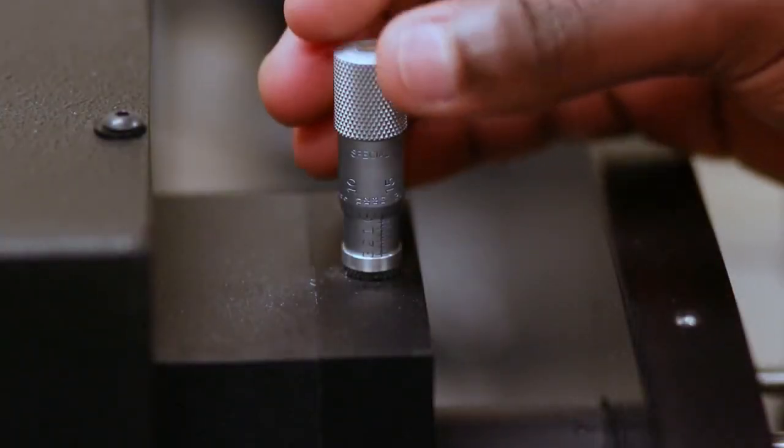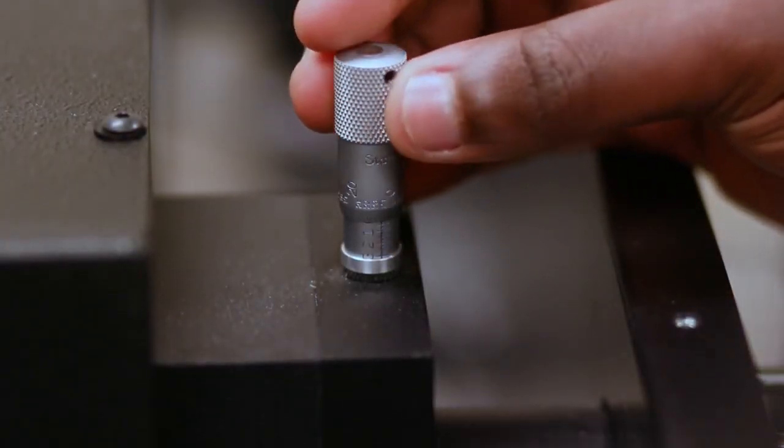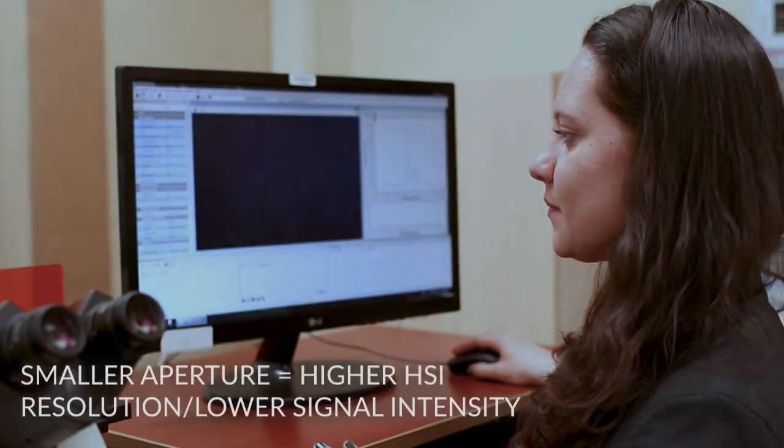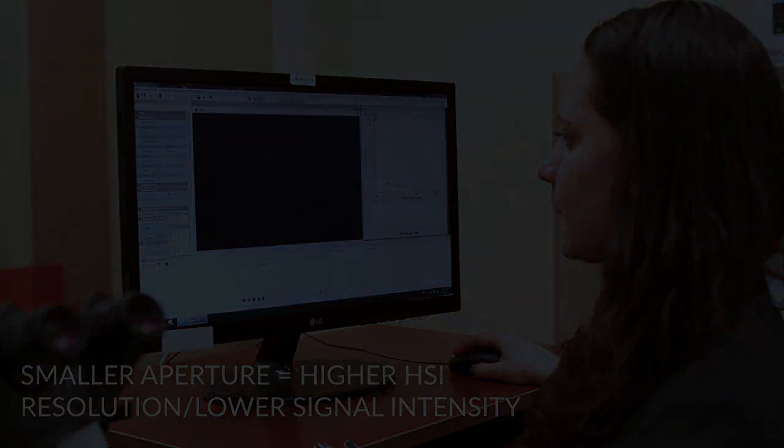When all of the cubes are in place, manually adjust the detector slit opening to match the size of the pinhole selected. Then, in the FiSpec software, select the aperture of the pinhole.